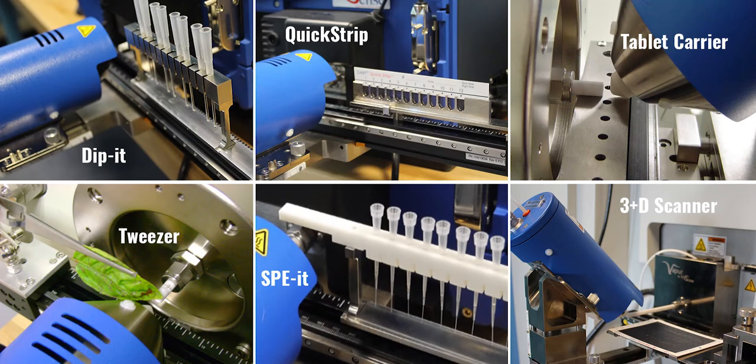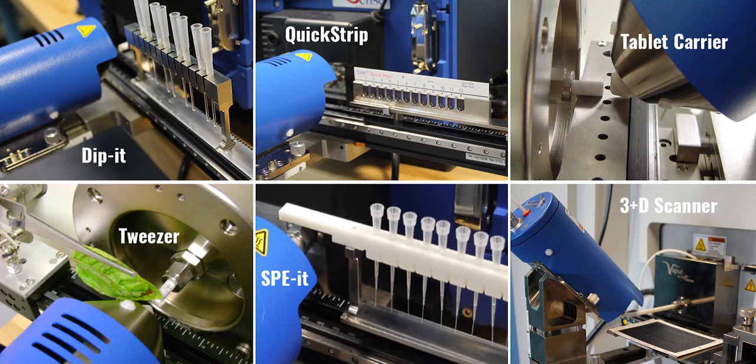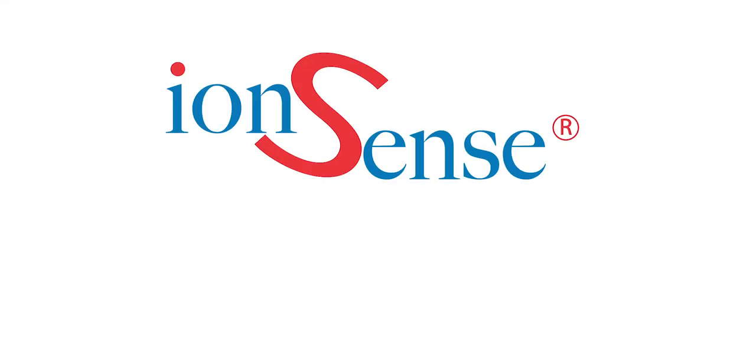This brief overview of the different options for sample introduction modules should help you determine which module or modules are the best fit for your sample types and applications.